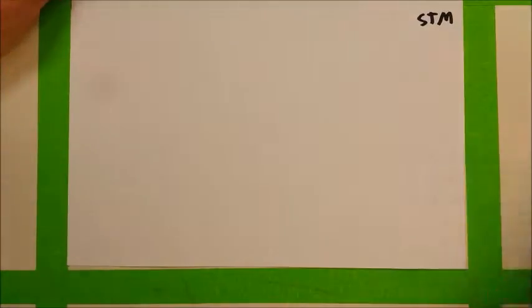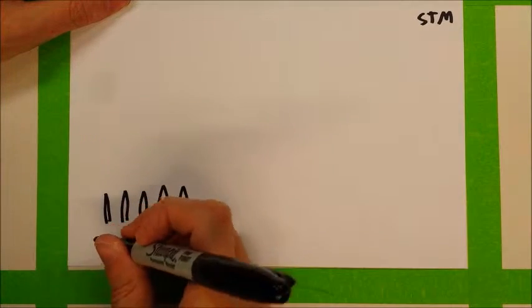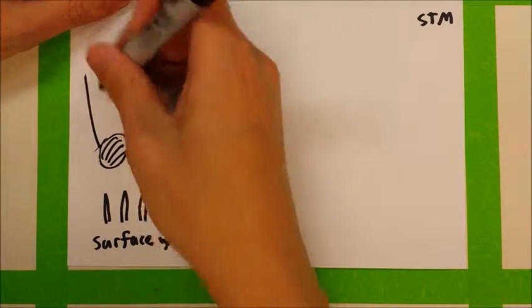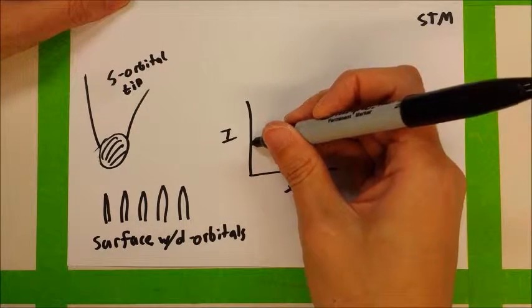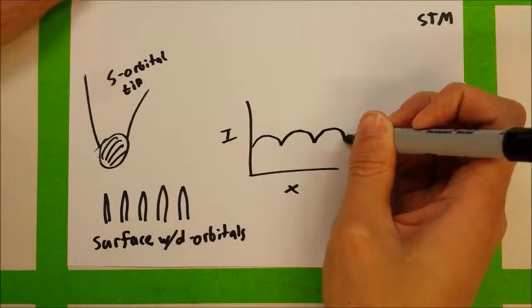So, just as a blunt tip, which images several atoms, can't give us atomic resolution, you can imagine that a surface of atoms having spiky D or F orbitals being imaged by a tip with a nice smooth S orbital at the end will end up looking a lot more like the rounded tip shape than the jagged surface.